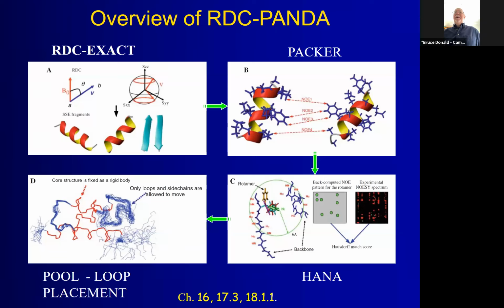So even if helix 1 and helix 2 are super far away from each other in the protein, even tens of angstroms, the orientation will be correct. Then it takes relatively few NOEs to pack these together, because you're not simultaneously resolving the orientations. It takes a fair number of NOEs to pack together 2 more or less rigid elements if you don't know the relative orientations. But if you know the relative orientations, it takes 3 or 4. Then you can pack them together.